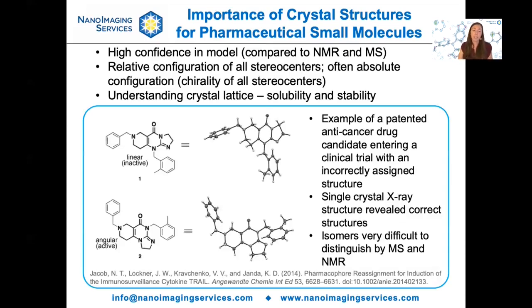Here's a good example of a drug candidate molecule that was patented and about to enter clinical trials when an academic group published a crystal structure of this compound and showed that the structure in the patent was actually not correct. Looking at this molecule, you can see that these isomers would be extremely difficult to distinguish by mass spec and NMR, and really it requires crystallography to distinguish the correct one from the incorrect one.